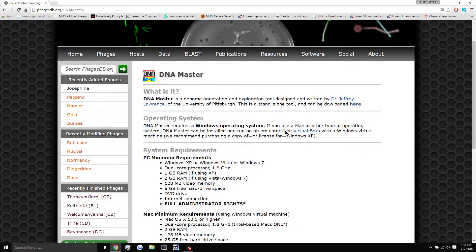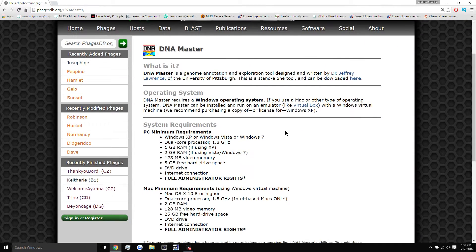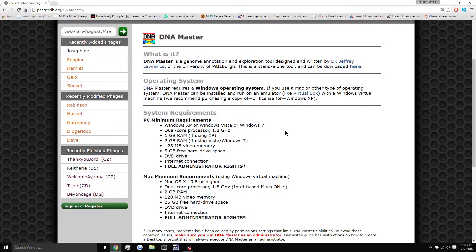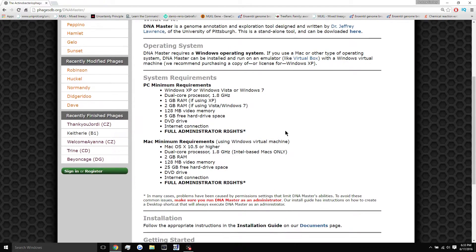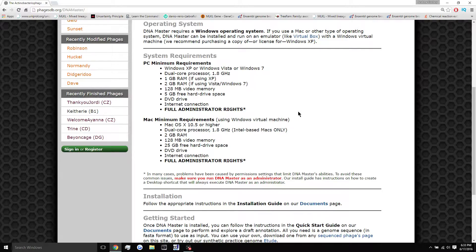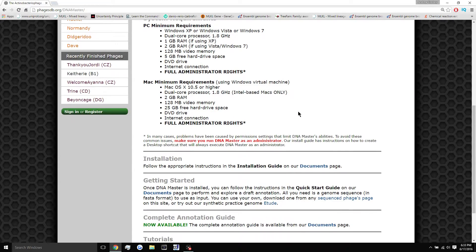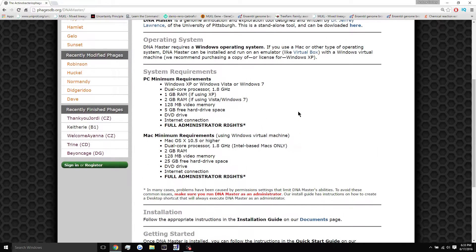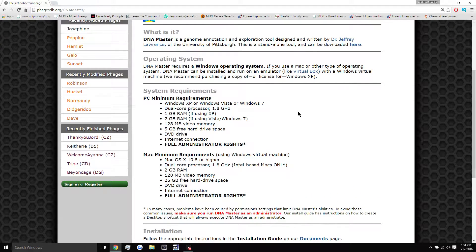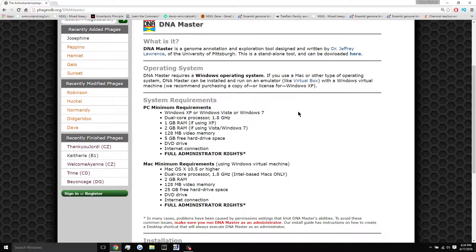Now DNA Master is a program that was created by Dr. Jeffrey Lawrence at the University of Pittsburgh, and it is a pretty powerful tool in what it can do with your genes and your phage genome. So this is what you're going to be working with when you're doing the bioinformatics of your phage, and it's a pretty awesome thing.